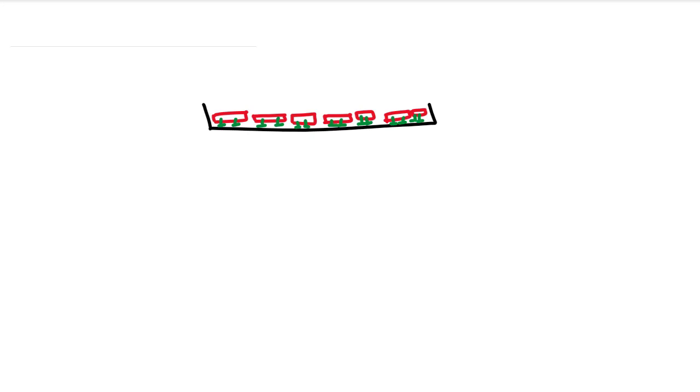When they're out of space, they become somewhat metabolically less active than they were before. In the case of some cells used in a laboratory, once you get to the state where there's no more room to go, eventually after a couple of days, the cells will actually die. So it's not good to have the whole bottom of the plate covered with cells. When the whole bottom of the plate is covered with cells, we say it's 100% confluent. It's this idea of confluency. You don't want to reach 100% confluency.